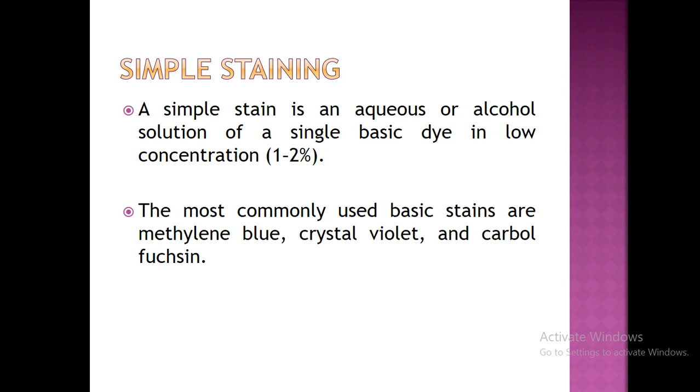So, there will be an attraction between this negatively charged bacterial cell wall and a basic dye which has a positive charge. So, whatever stain is used in simple staining should possess a positive charge.